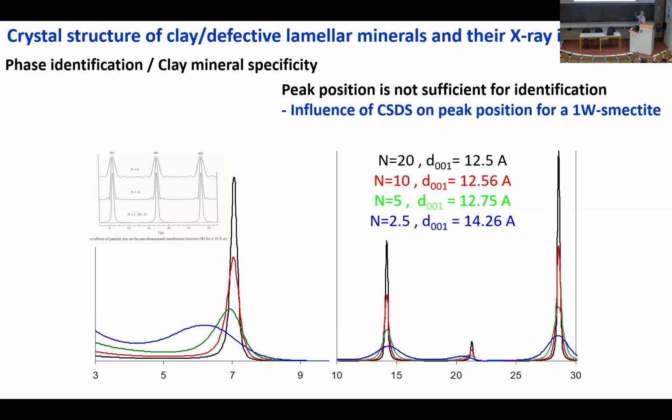And I've exposed some of that. So clearly, if you are recording diffraction data on a mica, you may not want to do all that because this could be an influence.